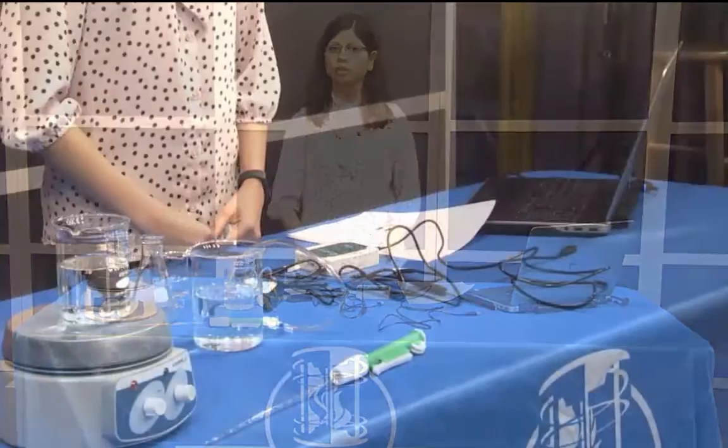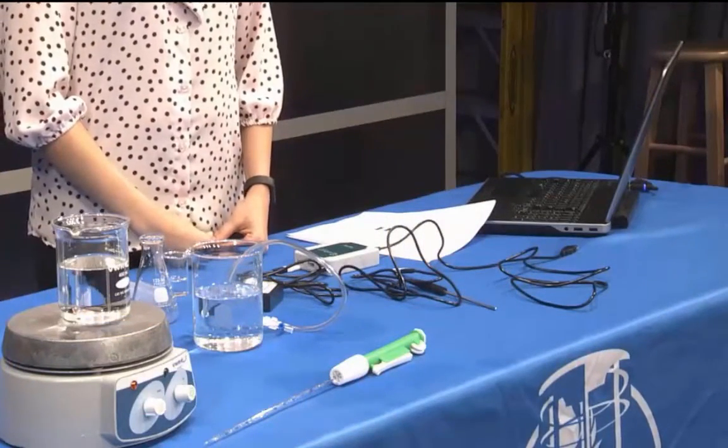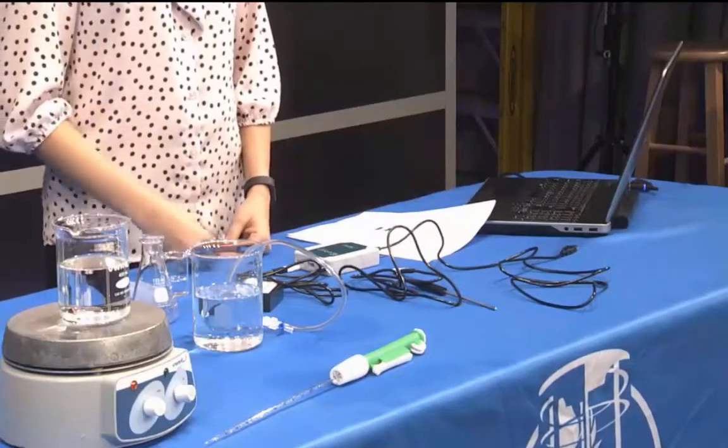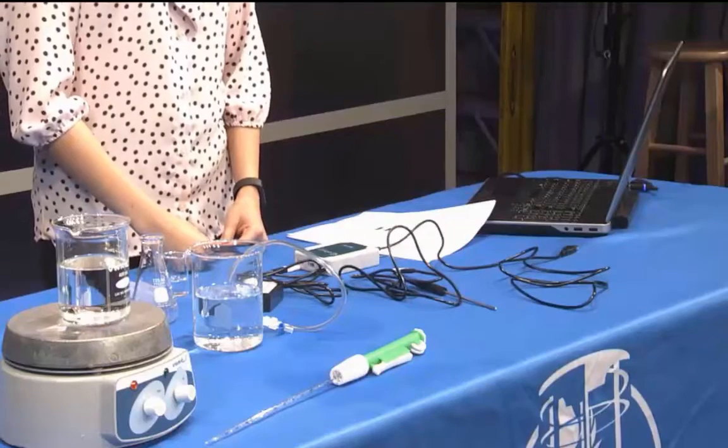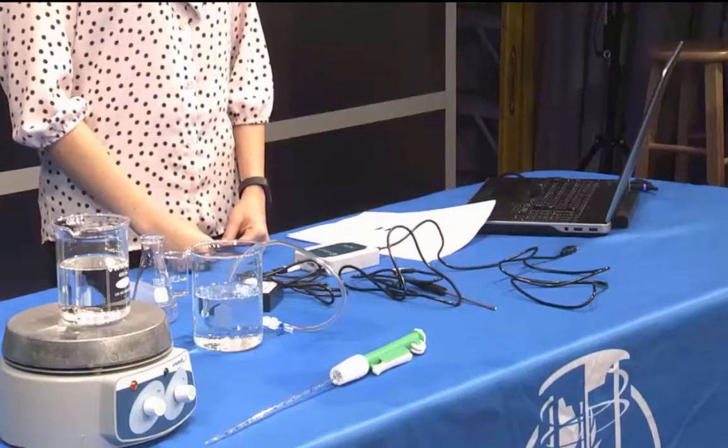You will be given two beakers. The 400 milliliter beaker filled with about 200 milliliters of water should be put on a hot plate on medium heat to begin heating. The 600 milliliter beaker should be filled with just enough room temperature water that covers the bulb and neck of the 125 milliliter Erlenmeyer flask. You will be adding more water to this beaker, and you do not want it to completely cover the flask.